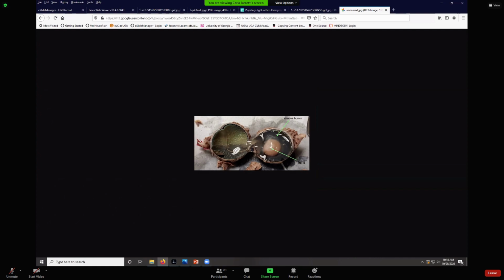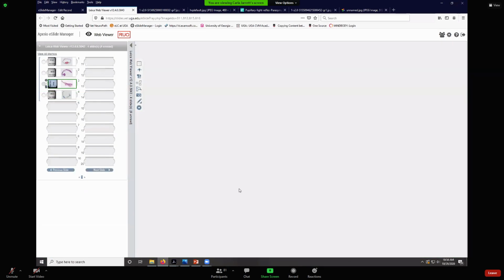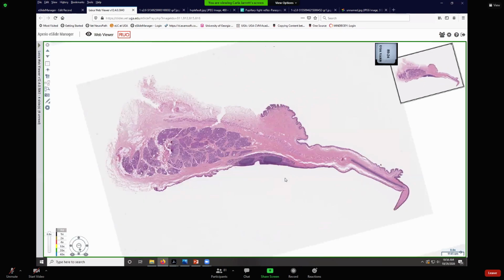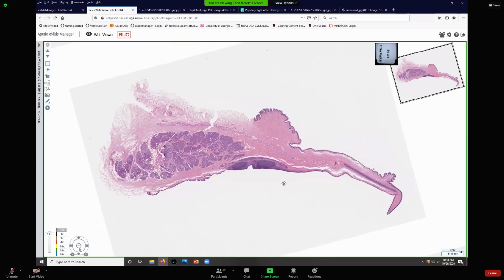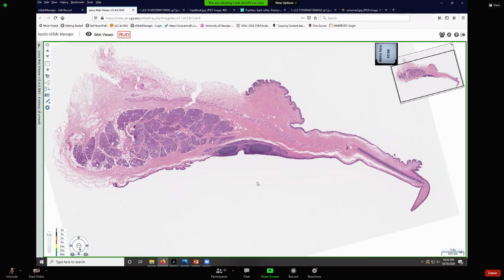All right, there was one more slide that you need to look at, and I know you're probably tired, but we do need to look at it. It's the third eyelid. And you might think, well, why bother? Well, I'm having to take online continuing ed courses this month because we can't meet for our normal continuing ed weekends. And one of my courses that I'm taking, one entire 60-minute lecture was on the third eyelid. So clinically, it's an important structure.